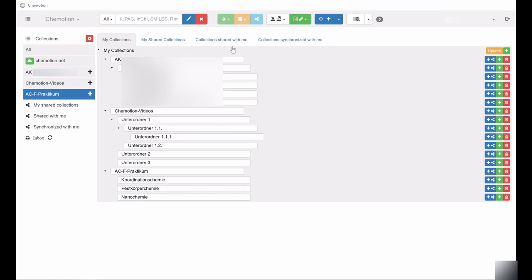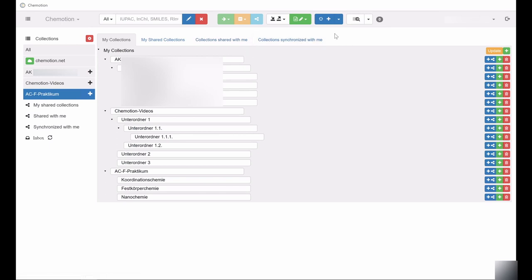Depending on your access privileges, you may also be able to edit shared collections. The difference between shared and synchronized collections will be explained in depth in a separate video.